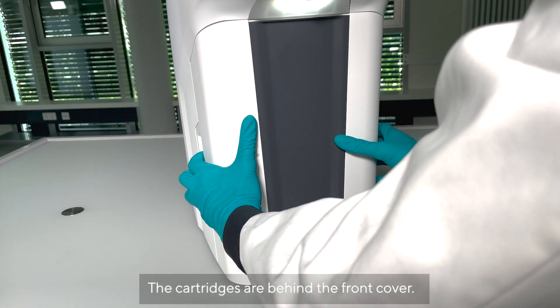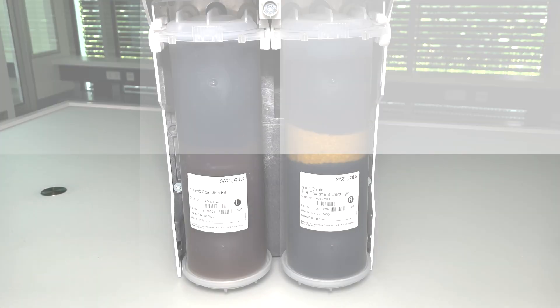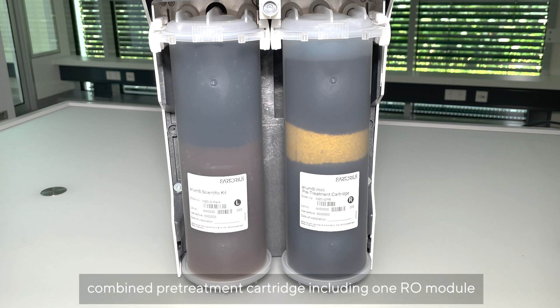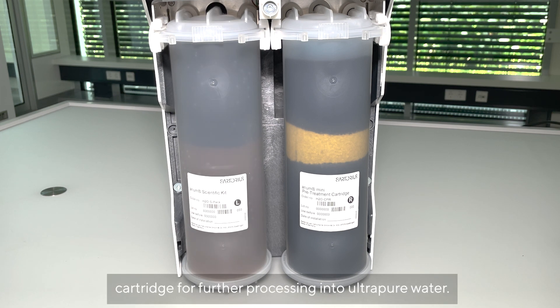The cartridges are behind the front cover. On the right-hand side there is a combined pre-treatment cartridge including one RO module, and on the left-hand side is an ion exchange cartridge for further processing into ultra-pure water.